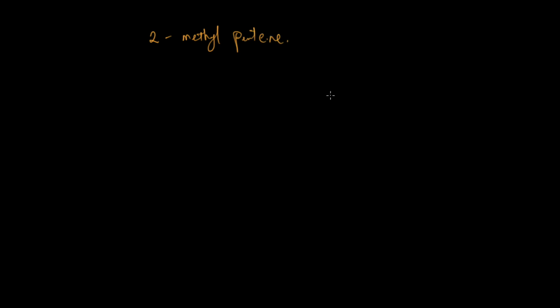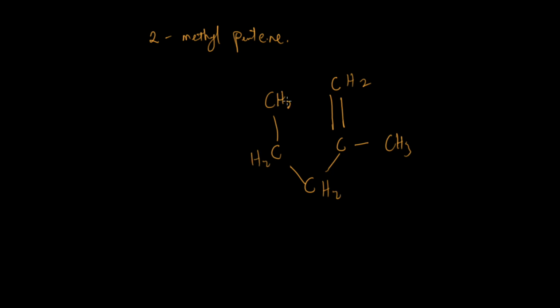So we have this structure, right? This is 2, we have this 4, and we have 5. First of all, we'll be able to see that, let me write it out, CH3, right? So this one is CH2, this one is CH2, this one is CH2, this one is CH3, but right CH2, we extend the hydrogen here. So we are able to see that this is alpha, this is beta, and this is gamma, right? And there's a gamma hydrogen there.